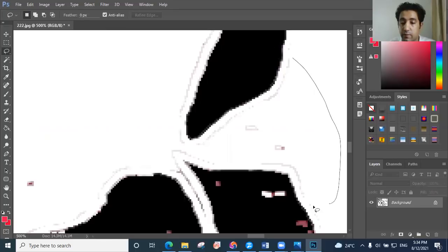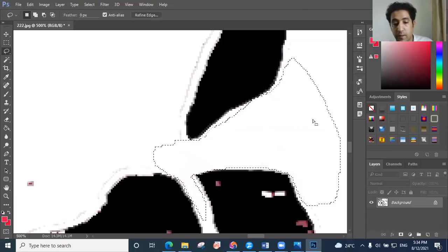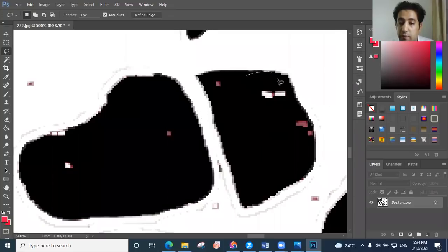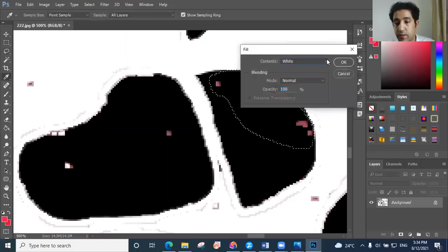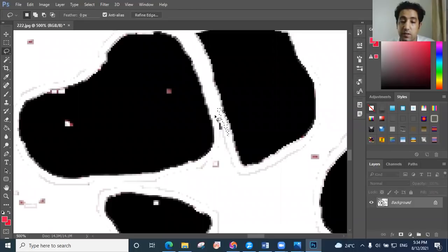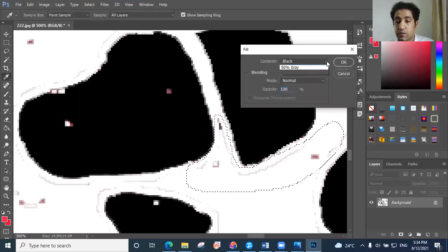Do it again. You can cut this because this is no problem. And if you want to cover just these dots inside the grain, just click here and then delete black. And all right, this must be clear. Change the color to be white, right?